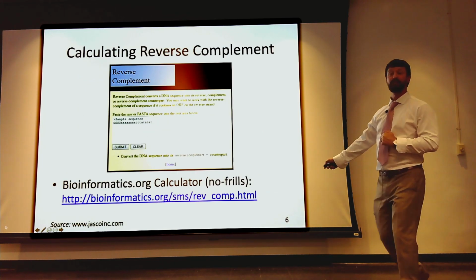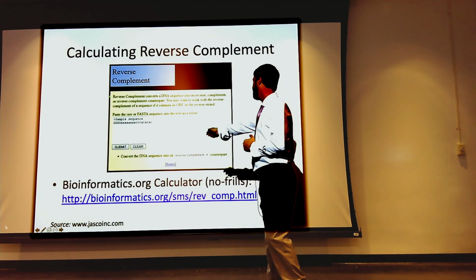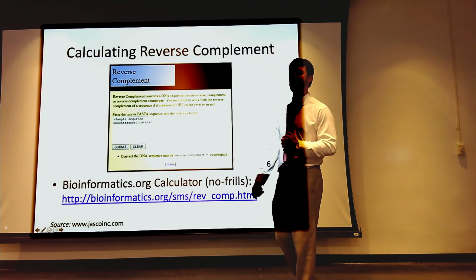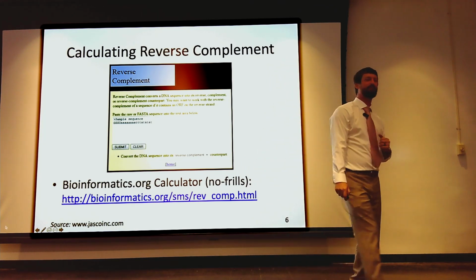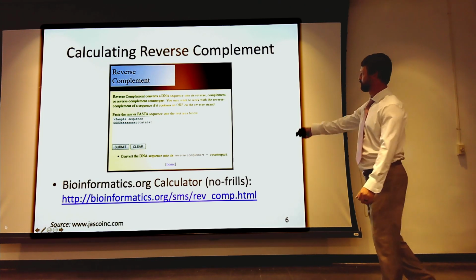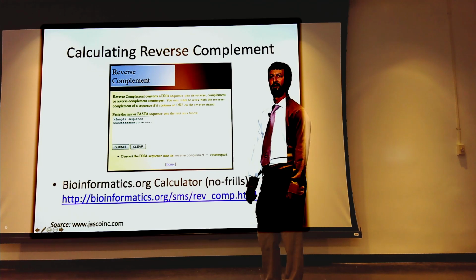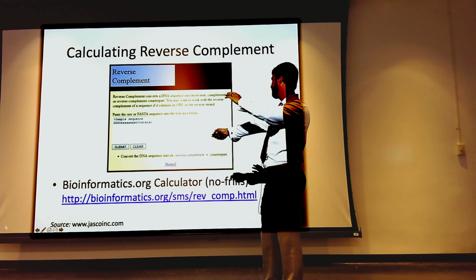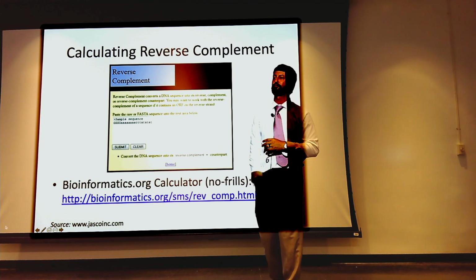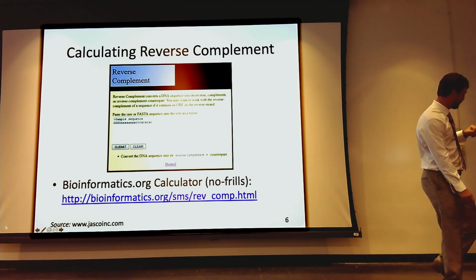You can calculate a reverse complement, right? Now, 5' to 3', right? That's what we said. There's directionality on your nucleic acid. You can write out by hand reverse complements. My boss tortured me for years and made us do all this by hand. There's this wonderful little thing. You can click reverse complement. It will give you the answer, right? You have to remember it goes 5' to 3'. You can make the opposite, but you have to flip around the direction. You have to reverse the sequence and then take the complement. You can't do one or the other.